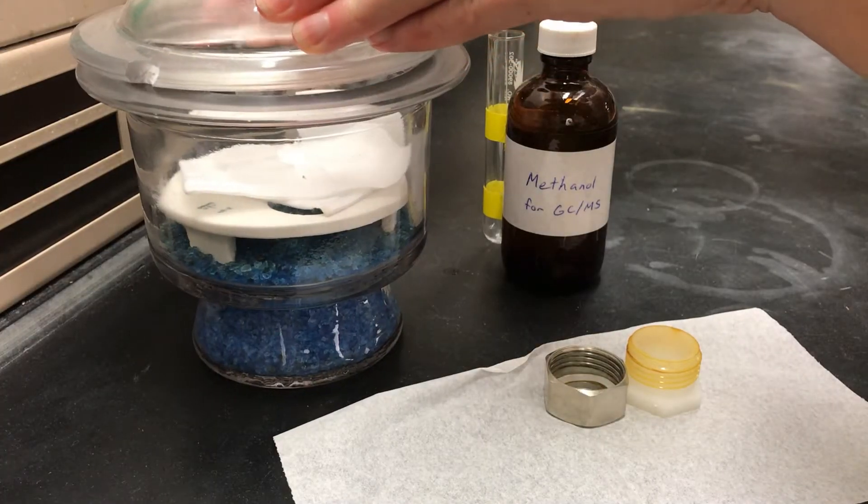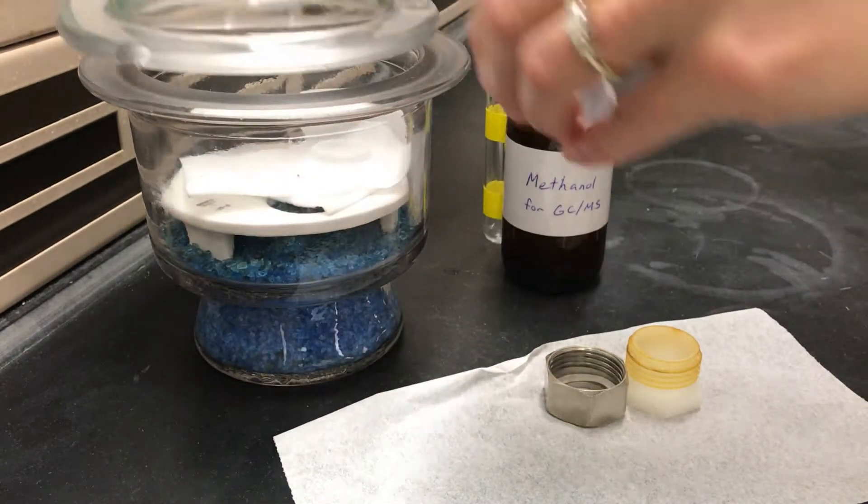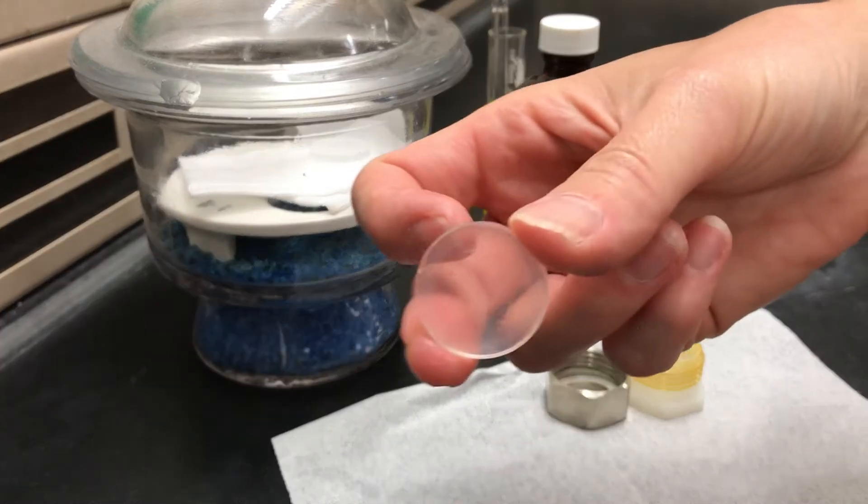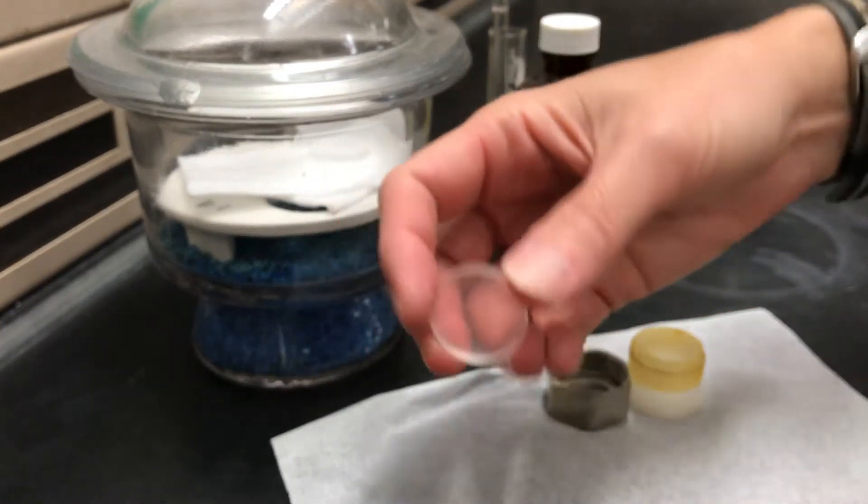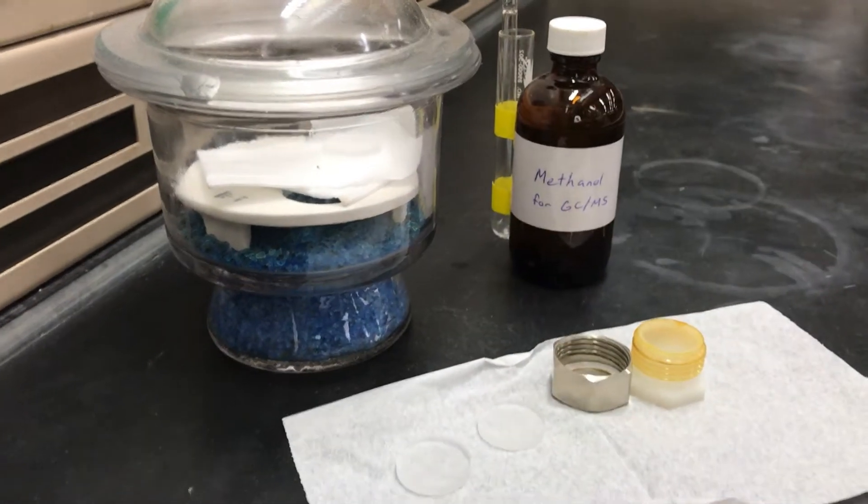The first thing we'll do is remove two salt plates from the desiccator. The ones that I use are made of sodium chloride and they're a crystalline form so they're transparent. But most importantly they're transparent to IR in the regions that most organic molecules absorb.